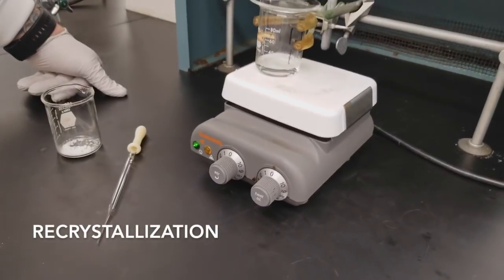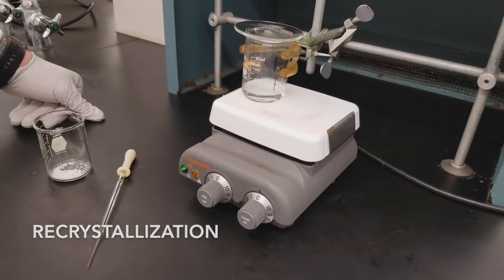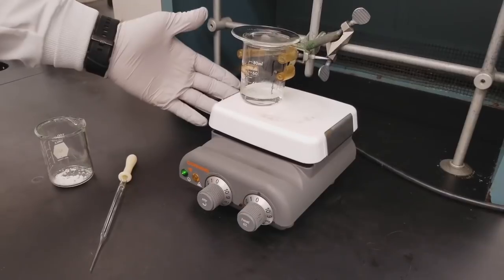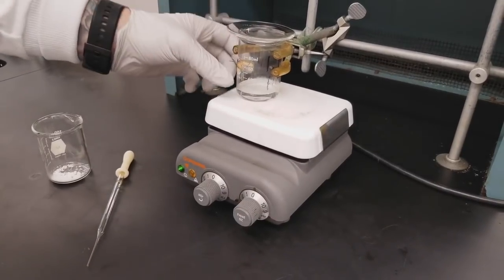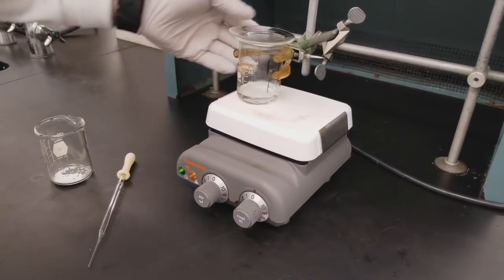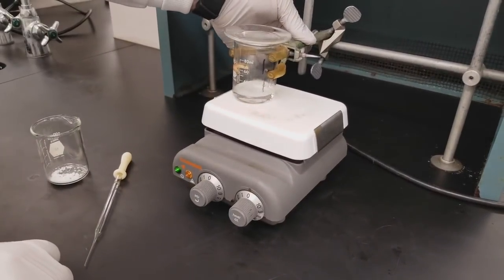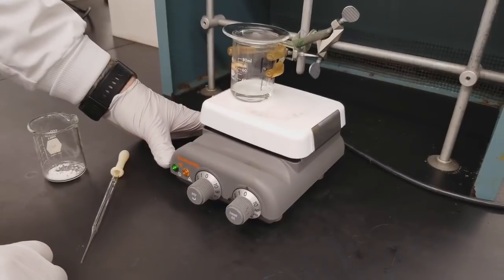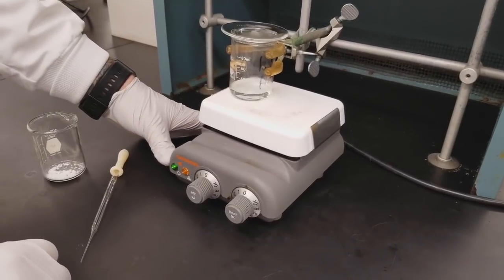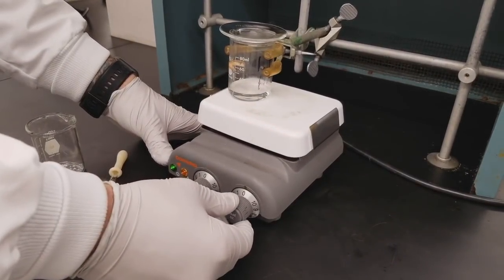We're going to detail how to do a recrystallization in this video. So we have our recrystallization solvent on a hot plate. It is clamped to a ring stand and so it is in a beaker with a watch glass on top. It's important to have this clamped so that we don't accidentally knock it over and send solvent flying.